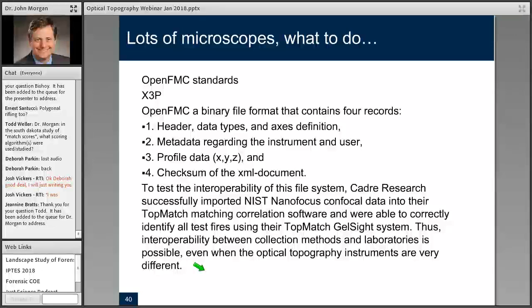And if every type of system could talk in X3P, then the commercial market can open up a great deal more. And it is my understanding, I do not work for ATF, and you heard the disclaimer at the front of this presentation, but it is my understanding that this is the direction that ATF is going with NIBIN, and that is that they want to see a much wider variety of systems to be able to use the NIBIN network and then talk in an interchange format like X3P.